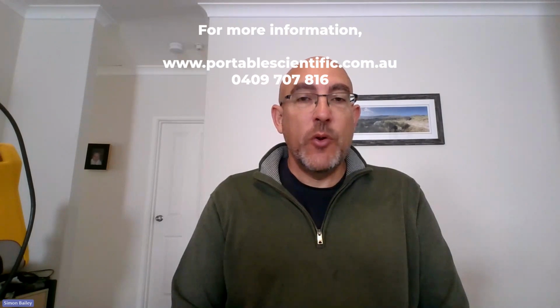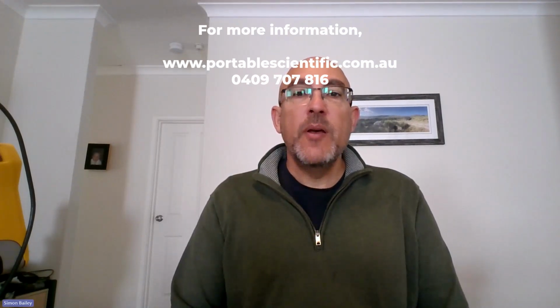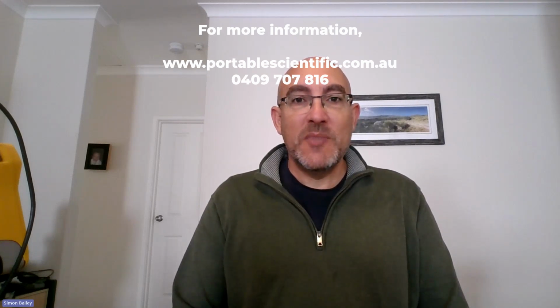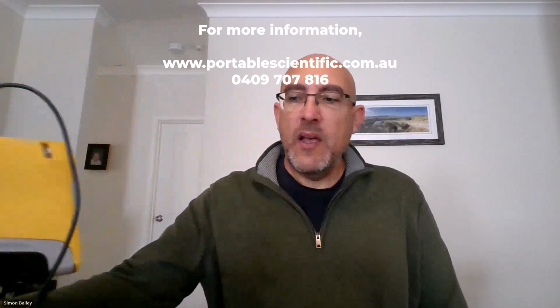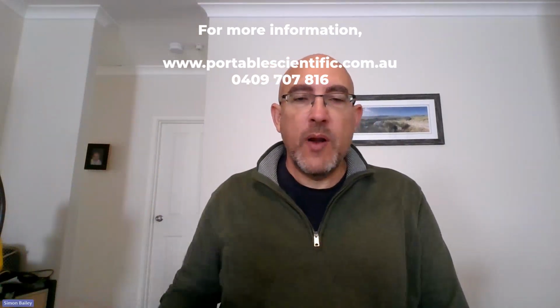Today I'm going to be showing you a very short video on how to use the Vanta desktop app to create a fleet profile and to adjust some templates. So I have with me a Vanta XRF. This is the Vanta Max. And what we'll be showing you is the latest version of their software. There are a lot of similarities with the previous version.